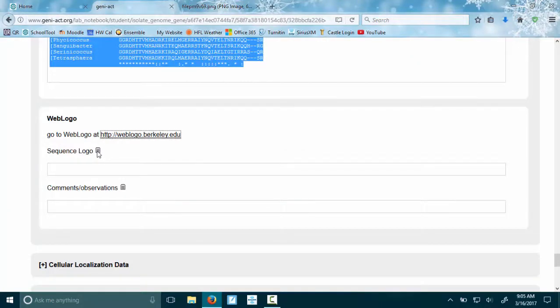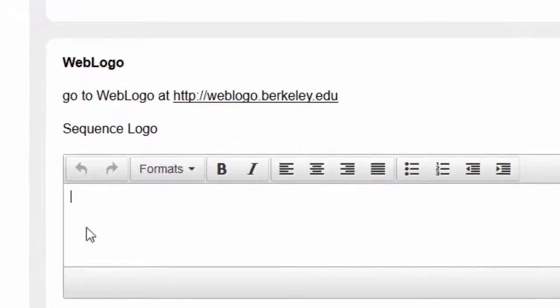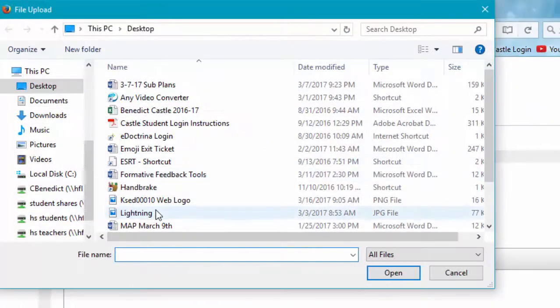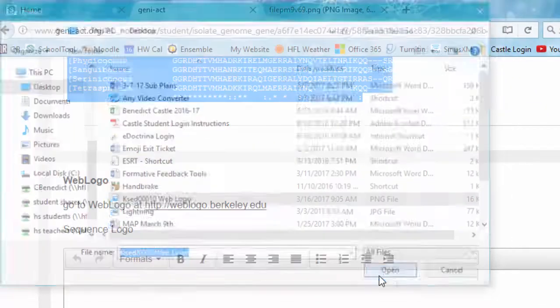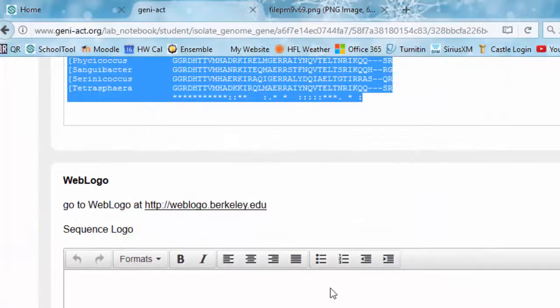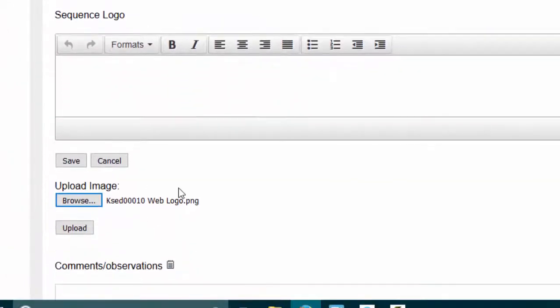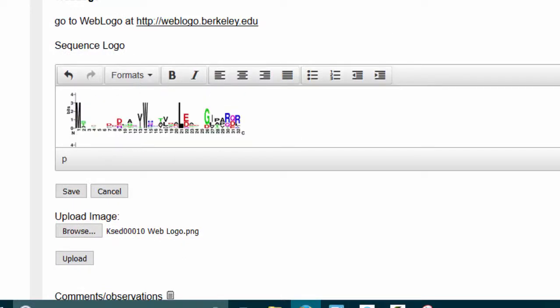It says I want the sequence logo, so you click the edit button, and this time I'm going to upload an image. I found it on my desktop, and I say open. It didn't appear because I have to say upload.